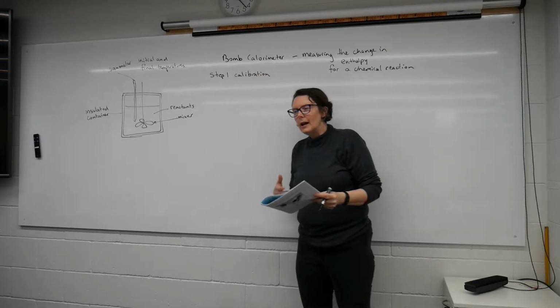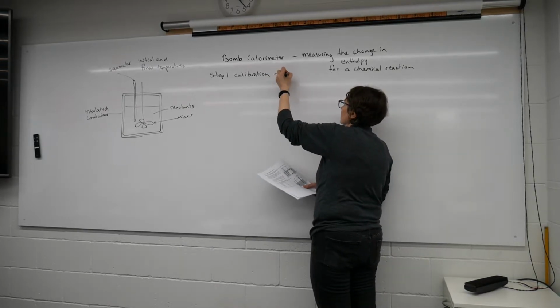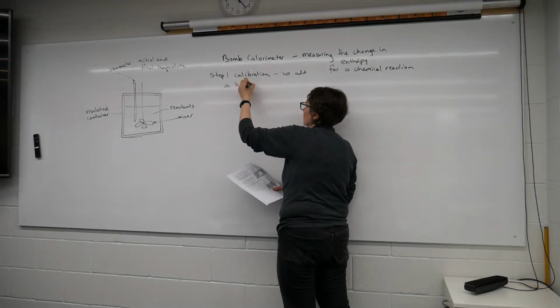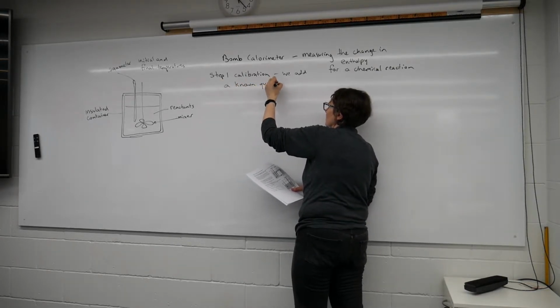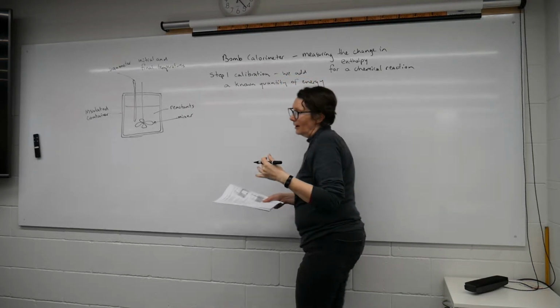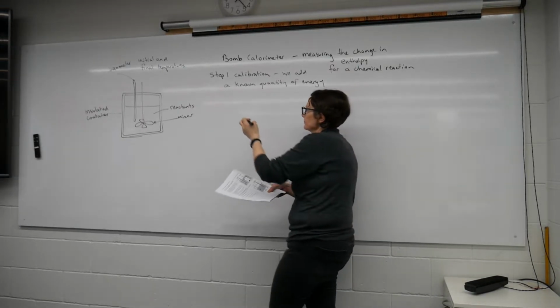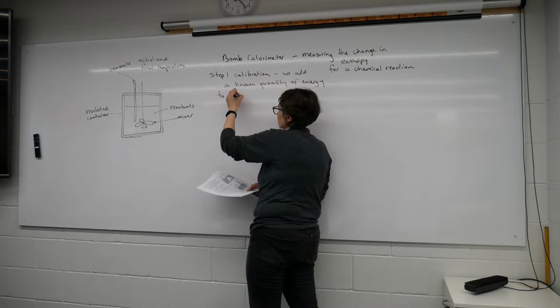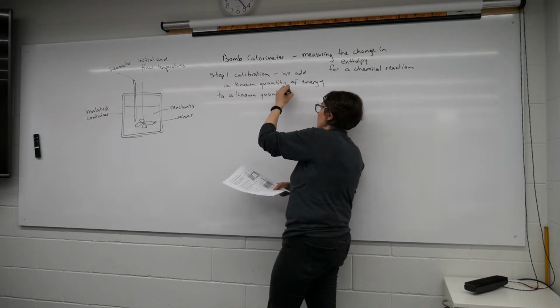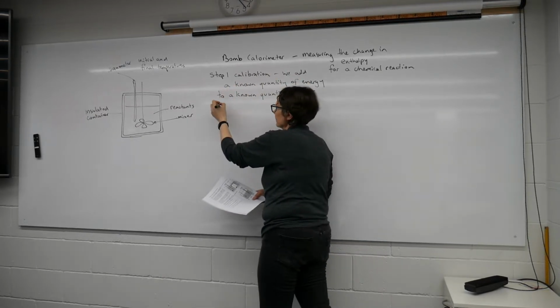And that is where we add a known quantity of energy to a known quantity of water, and we're measuring that change in temperature.